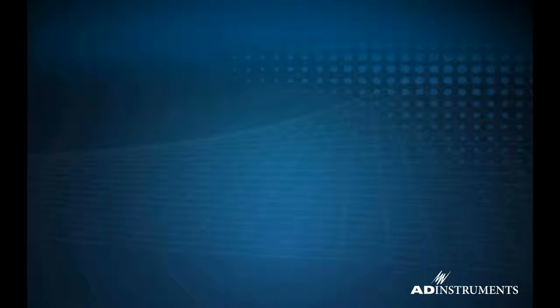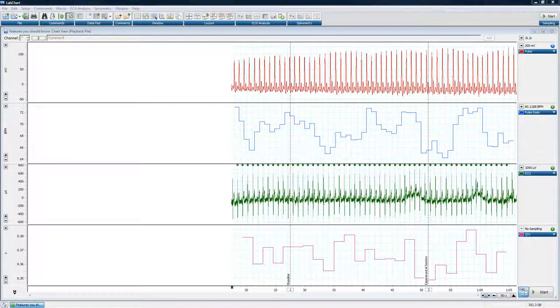Just a second here while I switch over to LabChart. You guys should see LabChart pop up here in just a second. What I have here is a file that I have created previously that's going to allow me to showcase some of these features that I wanted to showcase today.